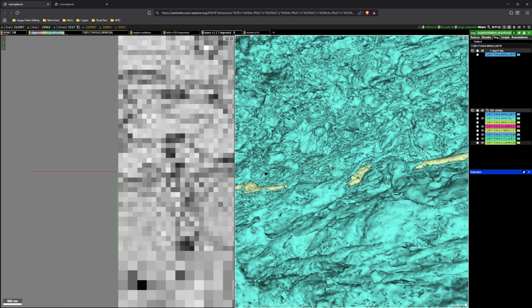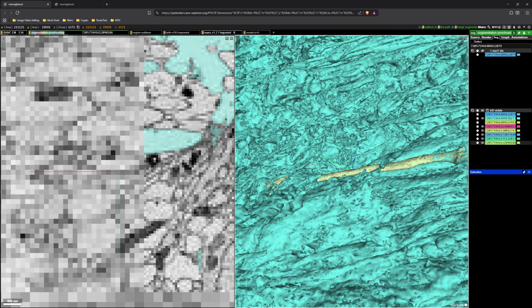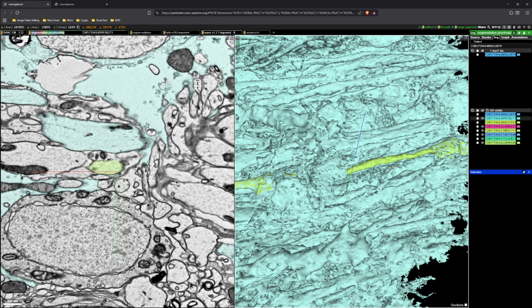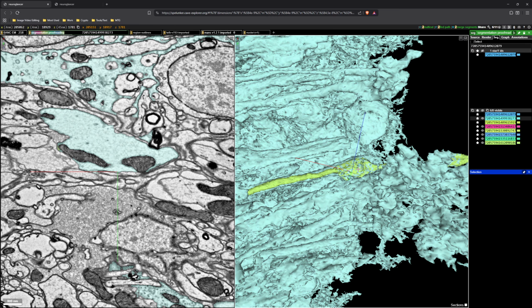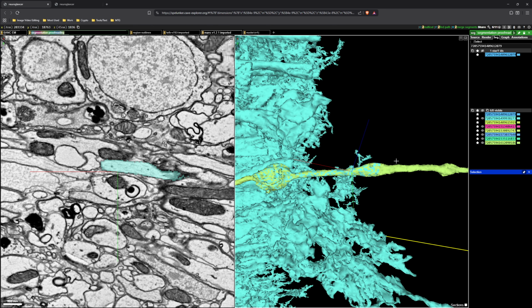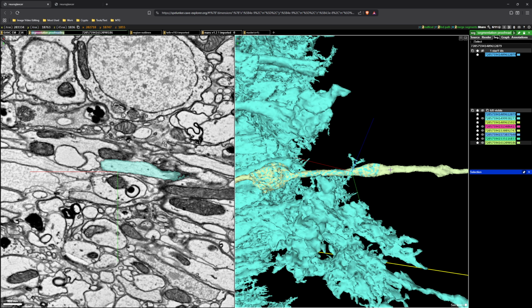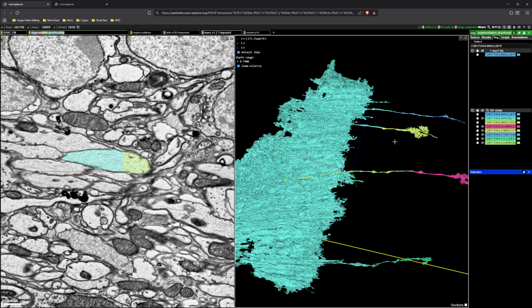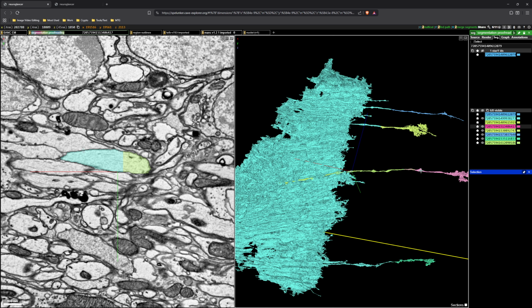So what I imagine happened and why that pink piece was separated to begin with was because the proofreader did that. And then they found that there was a merger here and a merger here, which you can still see the segment colors are overlaid on each other. And they went through the process again, and then I went through the process here and finished it off. So in theory, that would work, but what about in practice?